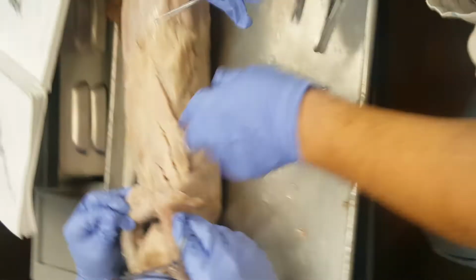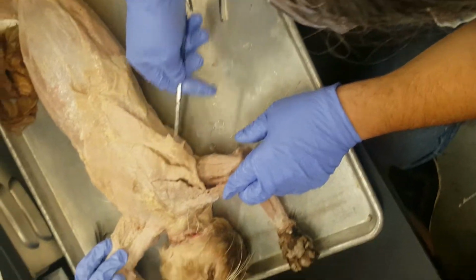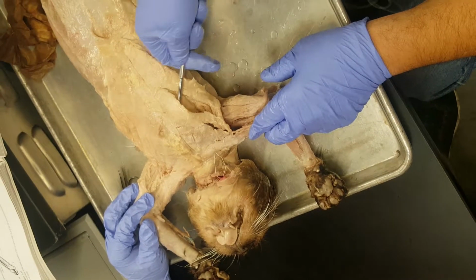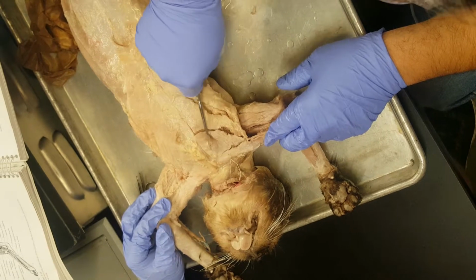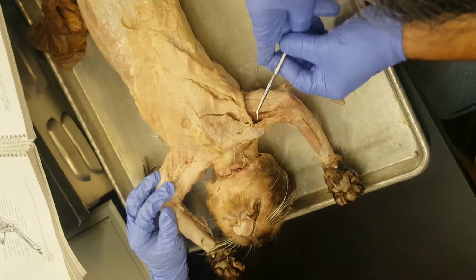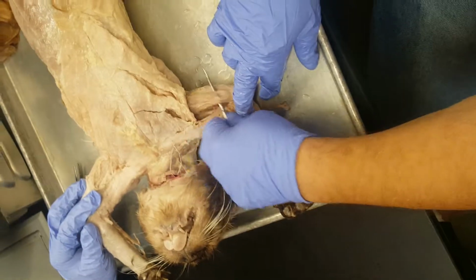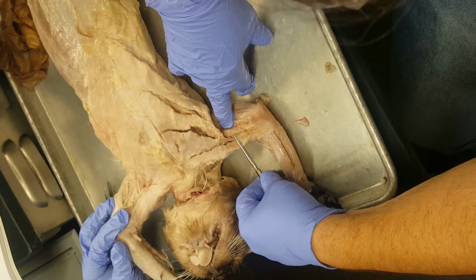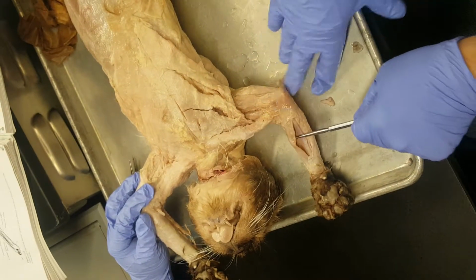Okay. Then up here we have your xiphihumeralis, your pectoralis profundus, sometimes called pectoralis minor. I think that's what you are. Pectoralis transversus, also known as pectoralis major, and pecto antebrachialis. And then you have your tensor fascia antebrachii, that would be epitrochlearis. And then there's your biceps brachii right there. See the little round one popping out? This is your palmaris longus.